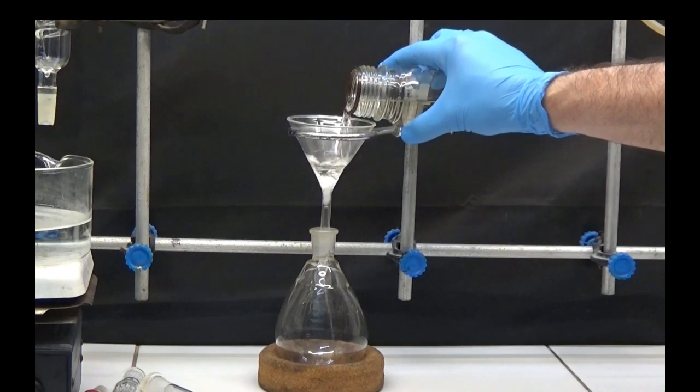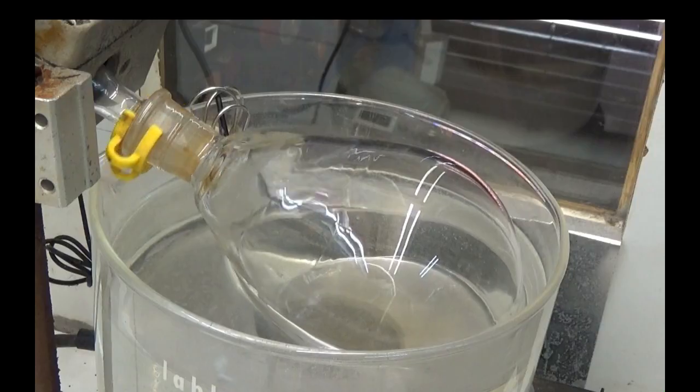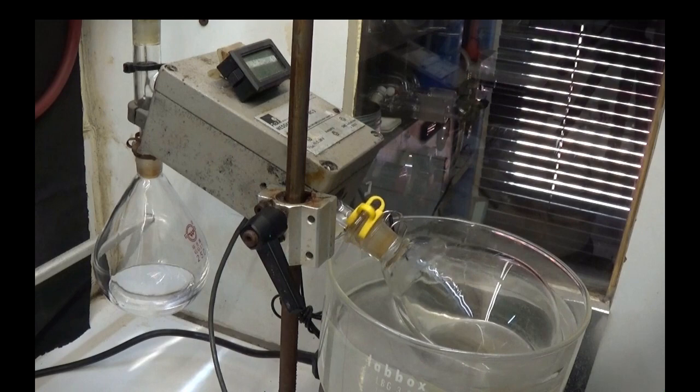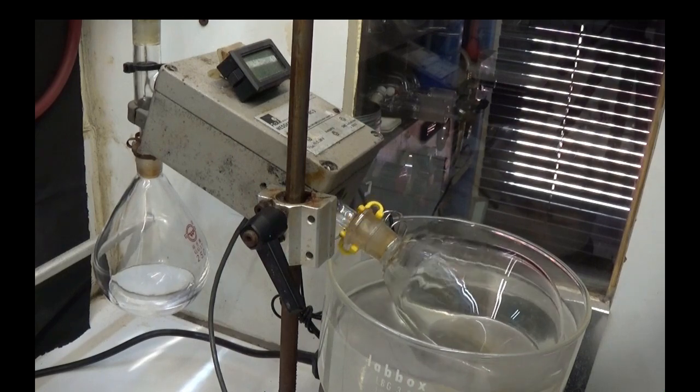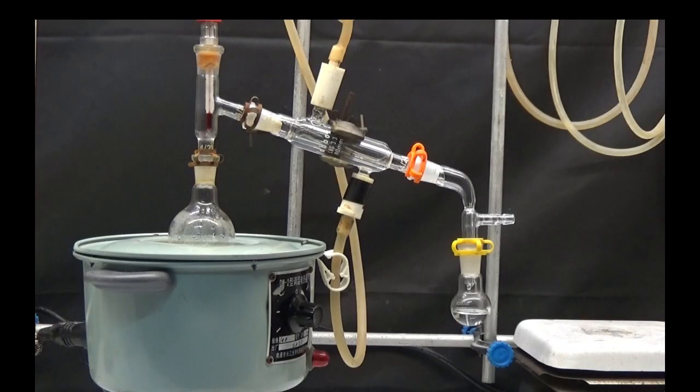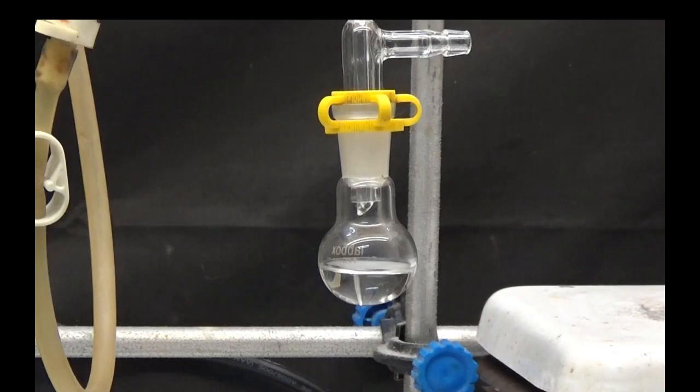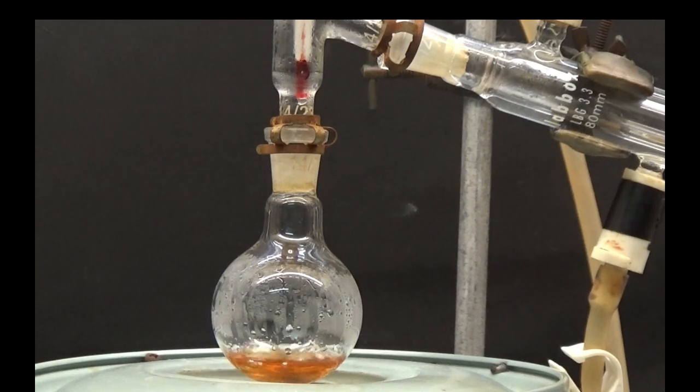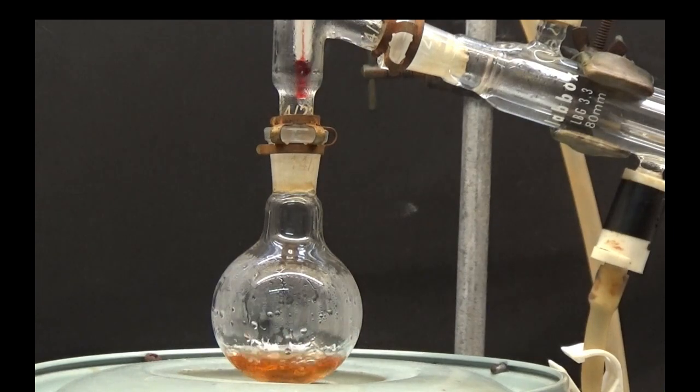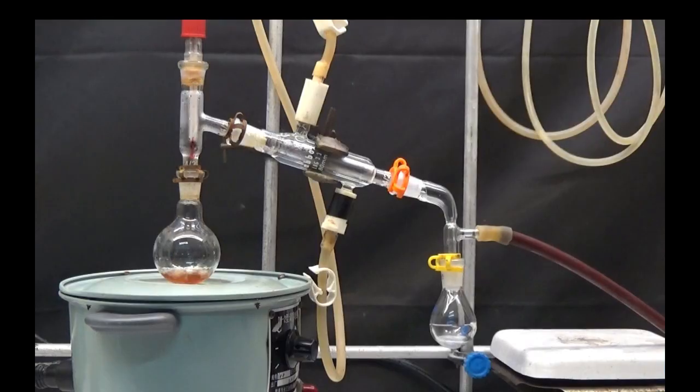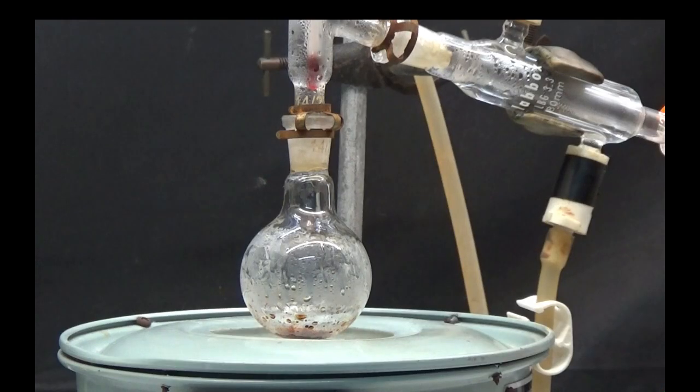Filter and evaporate the ether. Distill the resulting product. In the distillation, we will allow the temperature of the steam to increase to 150 degrees. Connect the vacuum and continue the distillation.